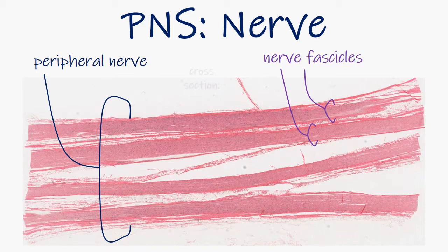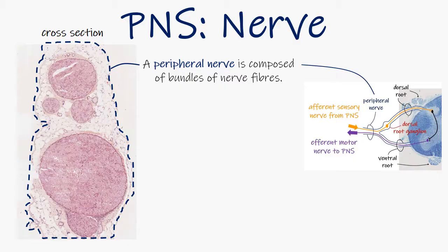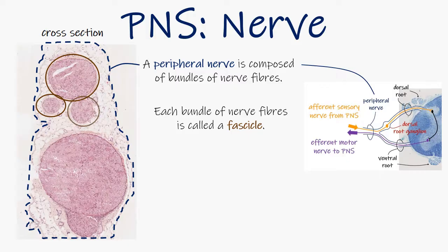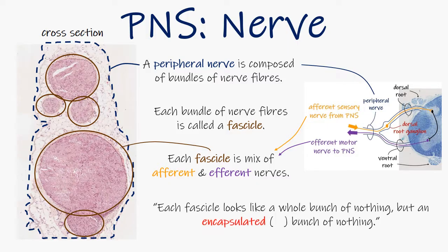Now let's look at a peripheral nerve in cross-section. What this means is that we will look down the length of the nerve fascicles in the manner, that is, in cross-section, that you will most routinely see them in many of the connective tissues and organs of the body. Here is an example of a peripheral nerve in cross-section. Begin by orienting yourself to this slide, which is a peripheral nerve composed of bundles of nerve fibers. Each of these bundles is called a fascicle, and we can see five of them in cross-section. These fascicles are composed of both afferent and efferent nerves. Beginners at histology often have difficulty identifying fascicles of peripheral nerves in sections of tissues or organs, and I am rather fond of saying that you are looking for structures that look like a whole bunch of nothing, but an encapsulated by connective tissue, bunch of nothing.